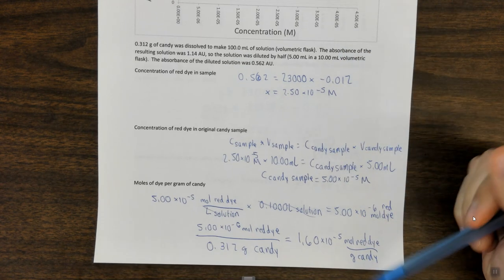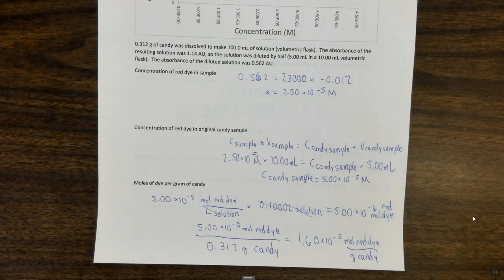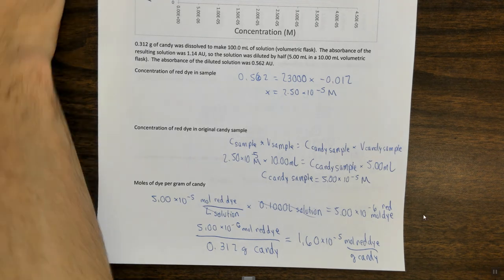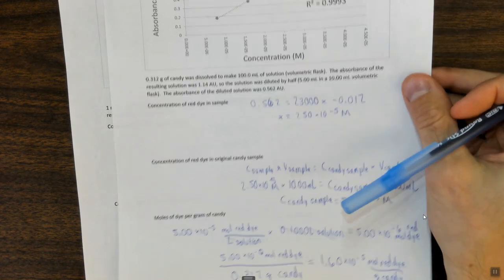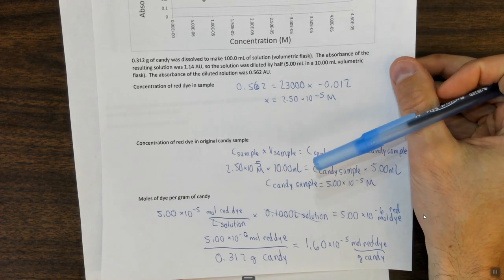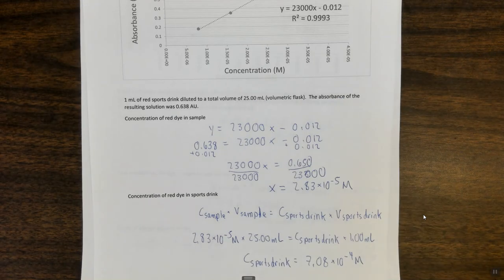So this is basically what I did. If you want to do grams of red dye, or blue dye in your case, per gram of candy, that would be perfectly reasonable as well. And all I would do is simply multiply by the molar mass of the dye in order to find that. So I hope you found these two examples helpful for finding the concentration of, in my case, red dye in candy, and for finding it in the original sports drink, because these dilutions and things are going to be required, but again, not in the exact same way that I am showing.